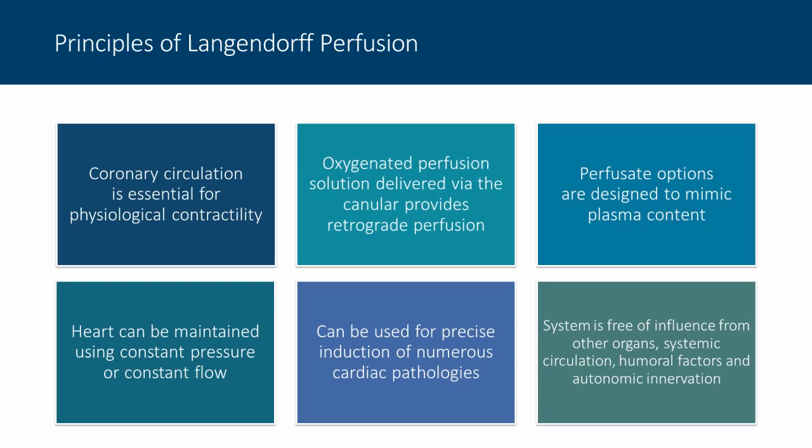And lastly, the system is largely free of influence from other organs. And this is really what I see as its main advantage. Without those other organs, humoral factors, and autonomic innervation, we are able to see actual cardiac specific events and effects.